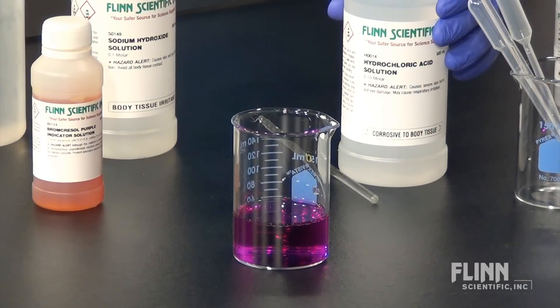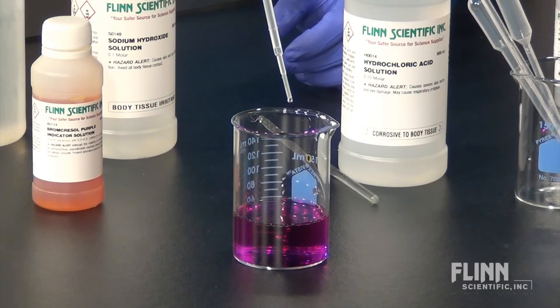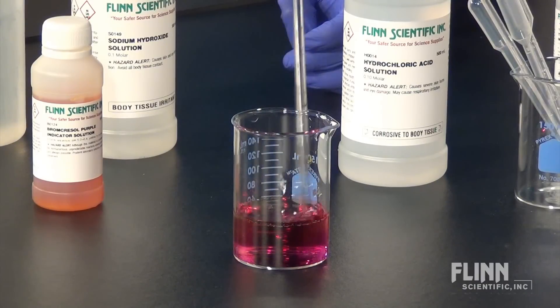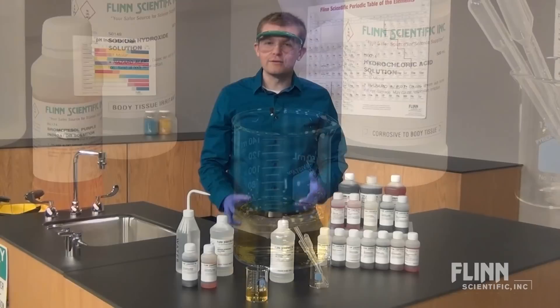Then add enough drops of 0.1 molar hydrochloric acid to neutralize the base and make the solution acidic. The solution should now change to yellow. If the solution changes colors as expected, then the indicator is viable.